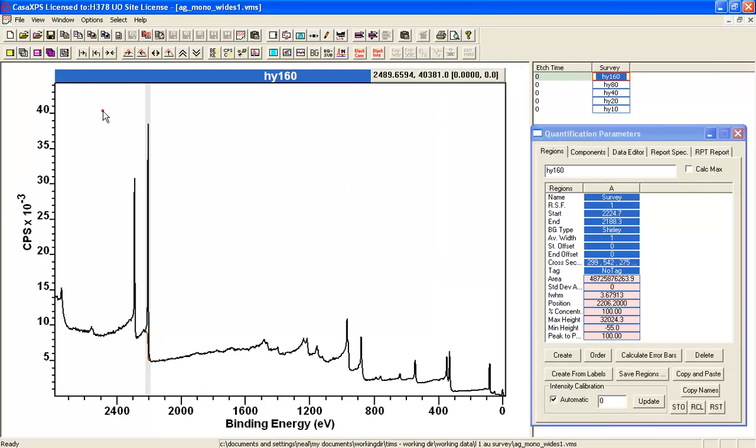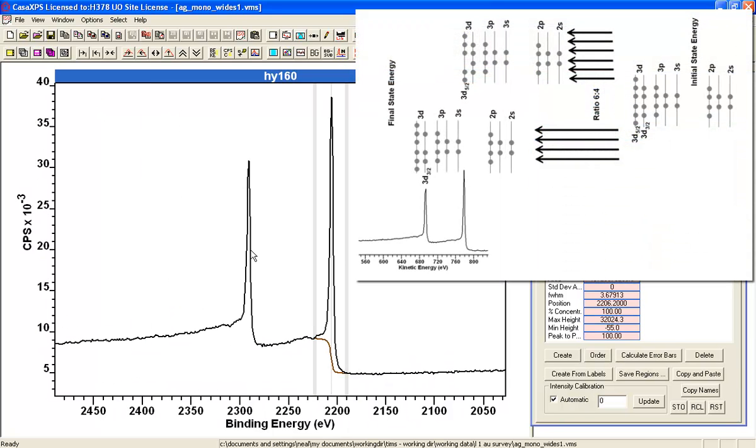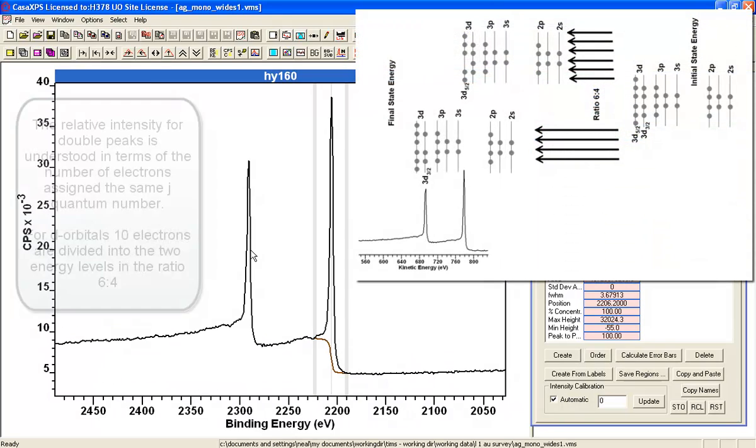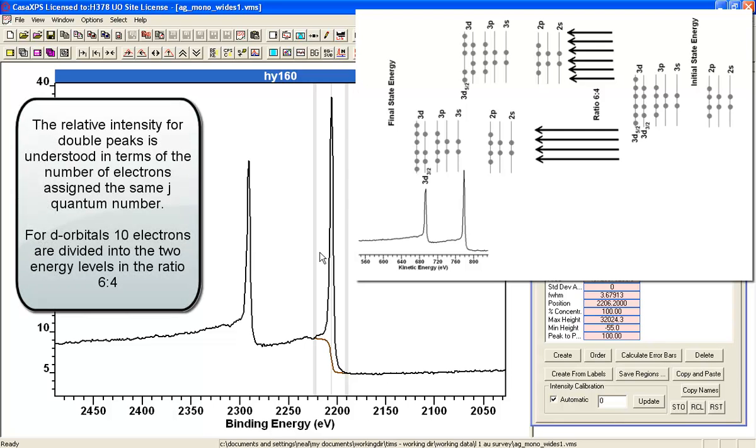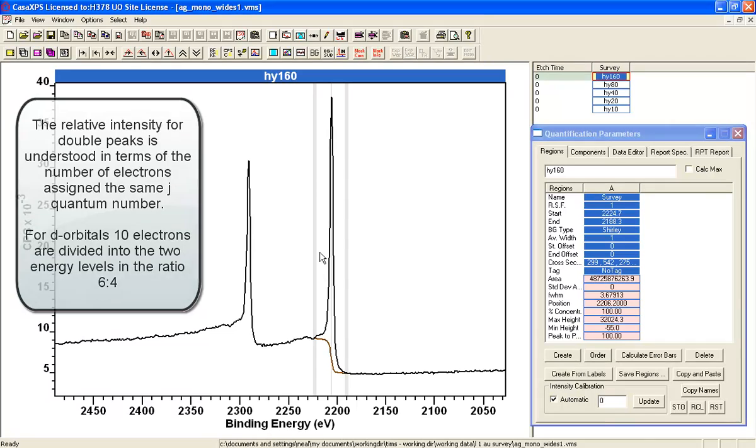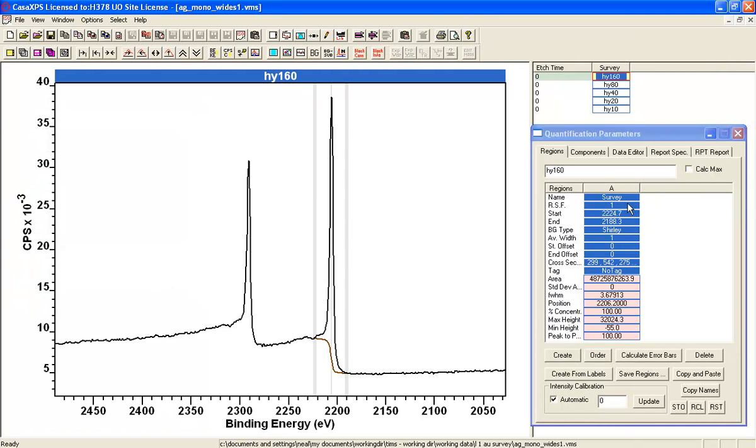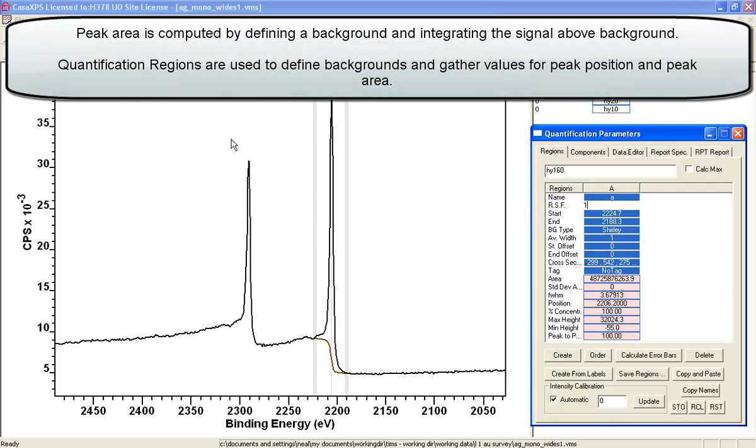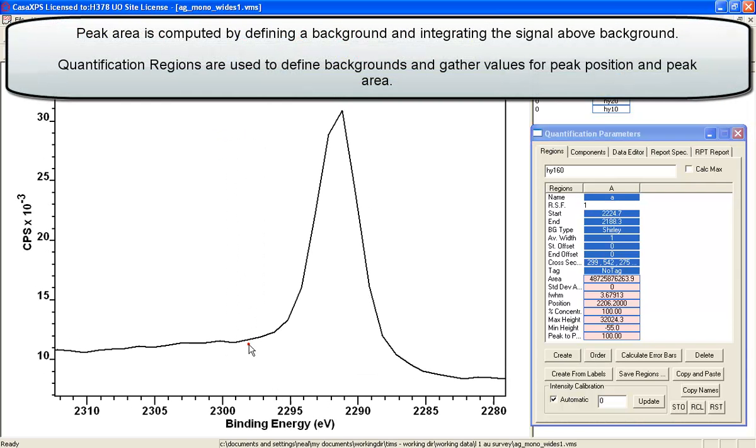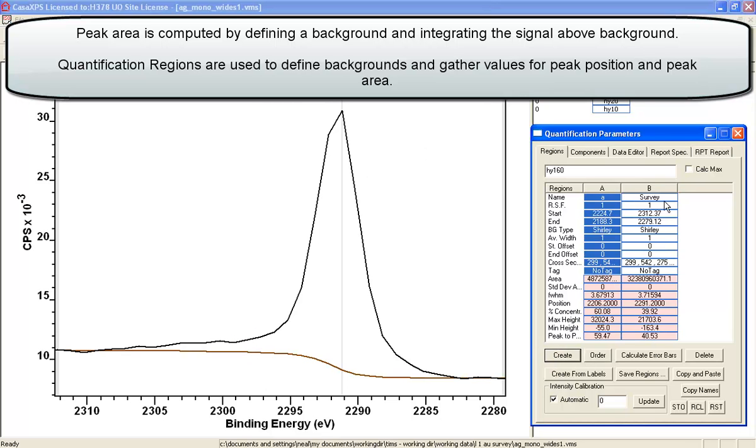So let us illustrate this point by looking at a pair of peaks for which it is clear the relationship between them in terms of the photoemission process. So I have already created here a peak that I will call A, and I am now going to create a second region which I am going to call B.